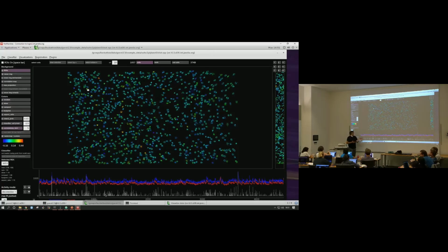Now, it's always going to be a noisy estimate because the data only says that much about the underlying spiking. There's always noise accumulated along the way from the microscope, from the algorithms, from all the processing going on. So, this is our version of the best version we found, at least, to get closer to an estimate of the spikes. The main reason we like to use this is it localizes patterns in time.